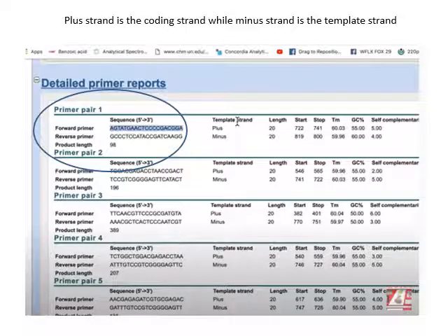Basically this procedure is not good if we want to amplify the entire gene, and we will show why. This slide shows the results. If we click on the results, this chart shows up. We chose 10, so I just took a picture of the first 5, but the result will be 10 pairs of primers. I put signs here to show the most optimal pair of primers, the forward primer and the reverse primer.